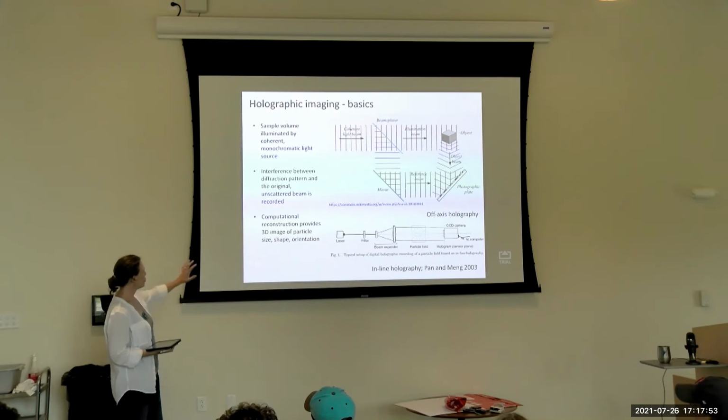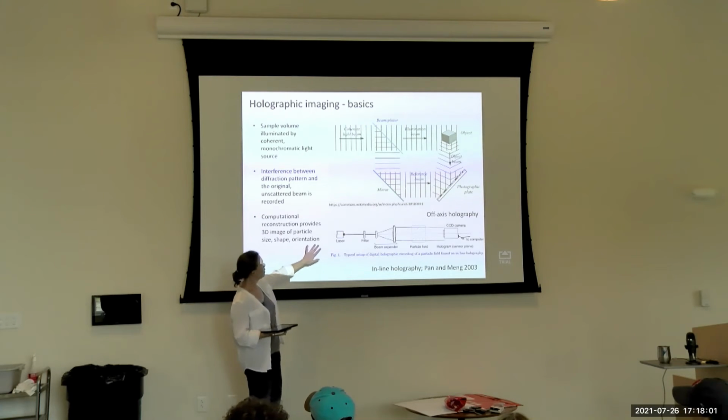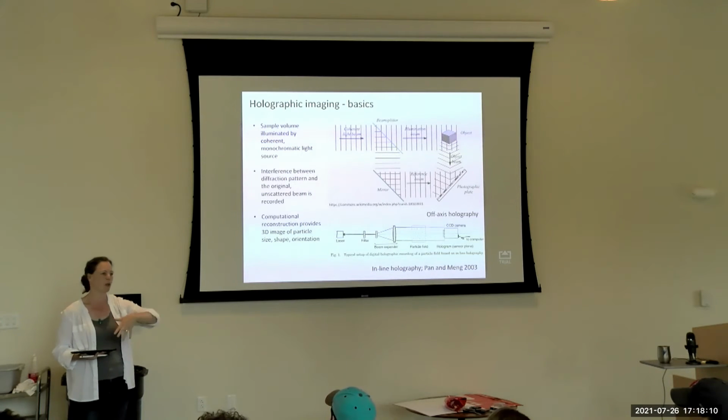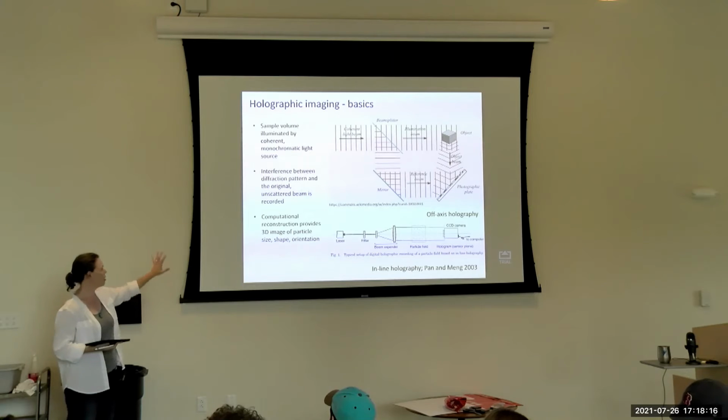Most of the sensors that are in use for marine applications use inline holographic systems. So the bottom panel is illustrating that. In this case, we just have an incident beam that diffracts around the particles and then interferes with whatever part of the beam has not been scattered. And reconstruction of that requires a numerical reconstruction.